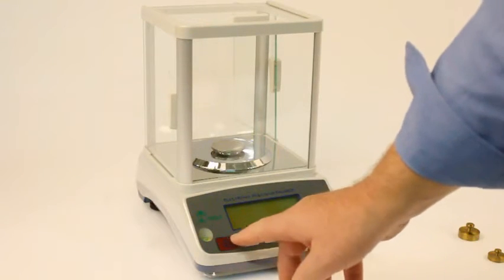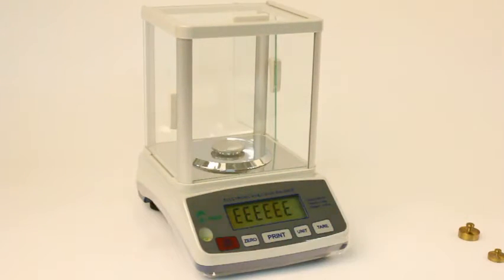To calibrate the HRB, we press the on-off button and wait for the display to show all dashes. Whilst we are waiting, please note that the HRB has an all-glass draft shield. When we reach all dashes, we will press the zero key.